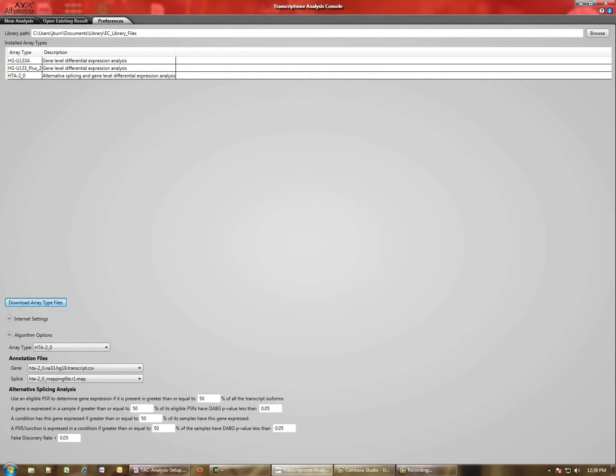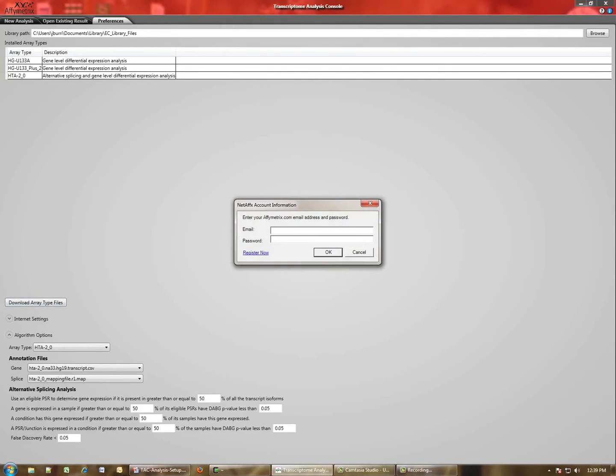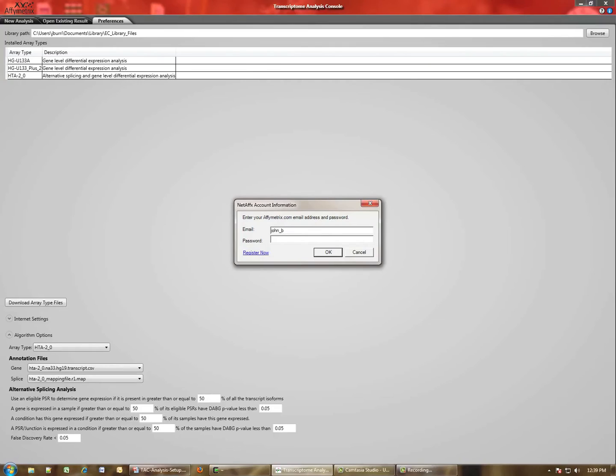it will take you to the NetFX site in order to download the files that are necessary to analyze whatever array you would like. So the steps are you enter your Affymetrix account for NetFX or Affymetrix.com.